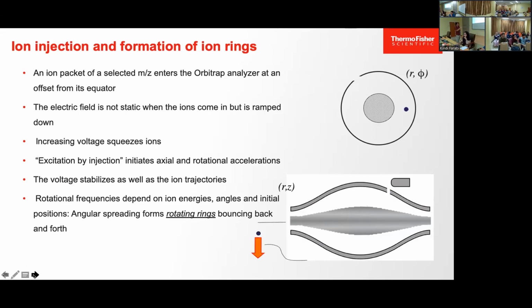This is how the ion is going to move: left, right, left, right, based on a very simple fundamental. Smaller ions move left and right faster. Bigger ions are slower, because they are less responsive. So this is how the mass spec monitors their oscillation frequency.